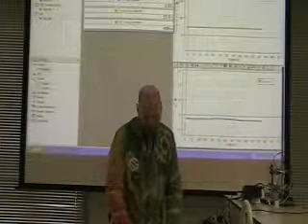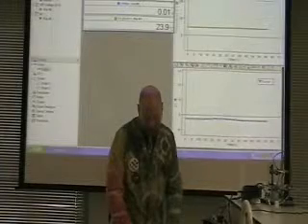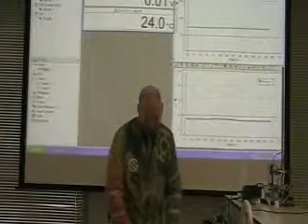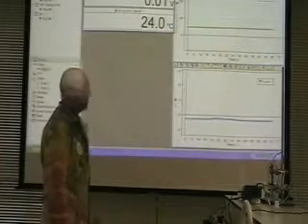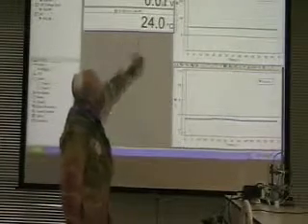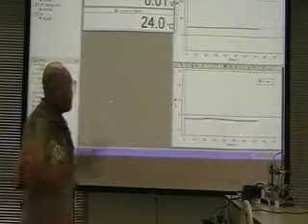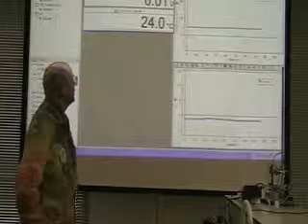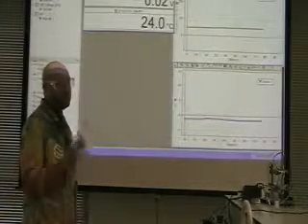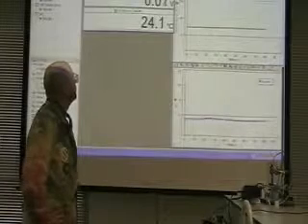Okay, so voltage I'm not interested in. Absolute pressure I'm not interested in. And so you can see that the temperature doesn't look like it's rising very much. Doesn't surprise me too much because it's not an insulated container. But again, it's taking measurements at much more precision than it's reading out there.